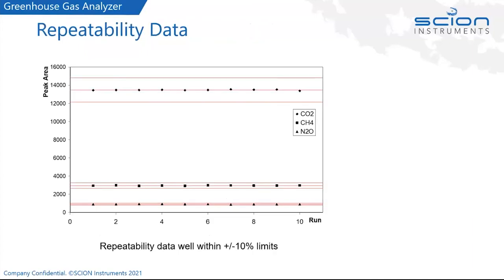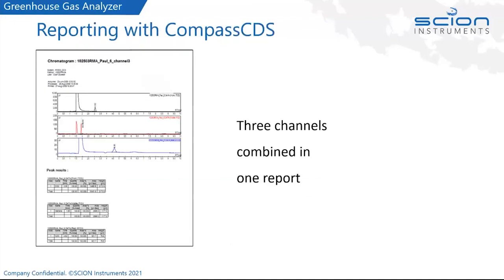For this, we use our software, which is the Compass CDS. And all the three channels are combined into one report, so you don't have to look at all kinds of different reports. It all comes out in one, and you have your data straight away.